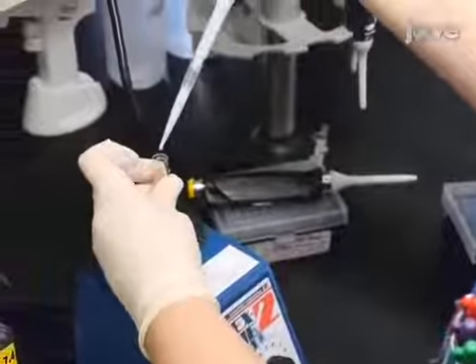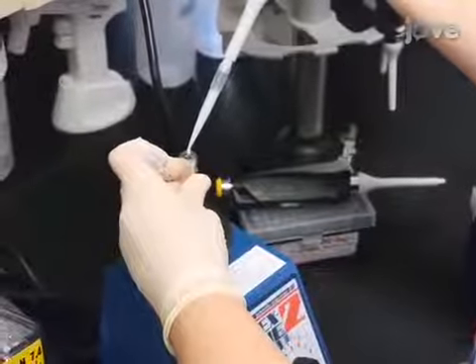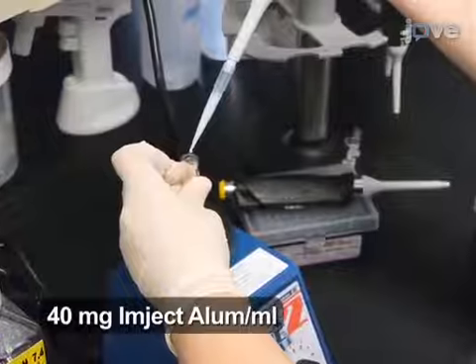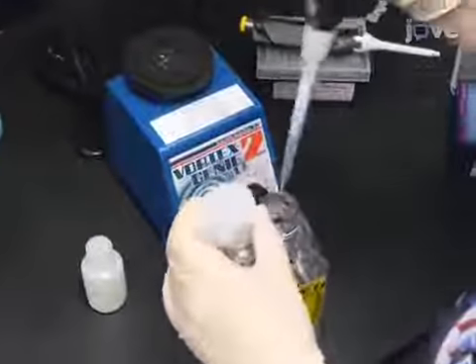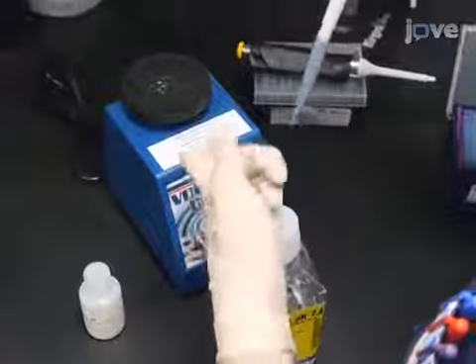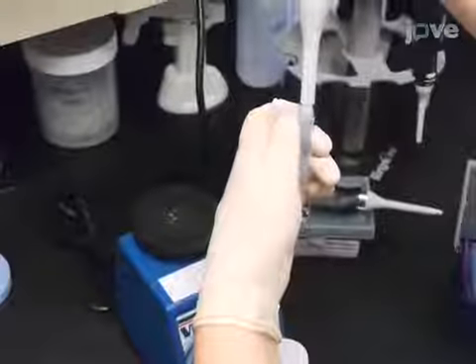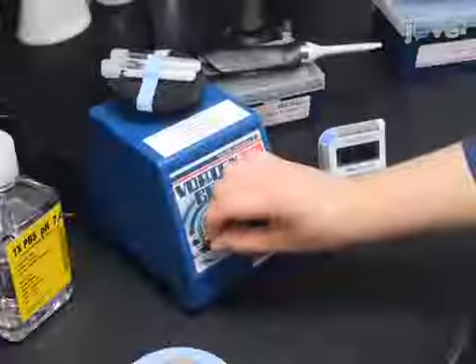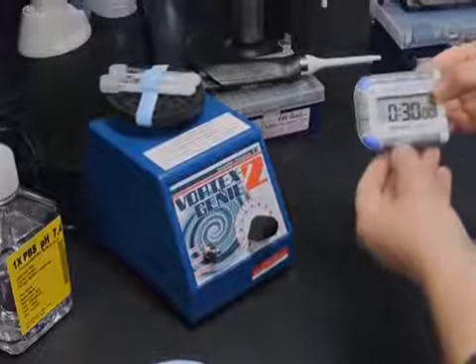Vortex the tube at medium speed and carefully add an equal volume of thoroughly homogenized Imject alum to the ova solution dropwise. In parallel, prepare a negative control solution of alum mixed into PBS at a 1:1 ratio using the same technique. Then cap the tubes and secure them to the vortex. Run the vortex at the lowest setting for half an hour with the tubes attached.